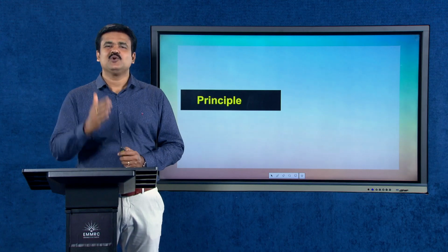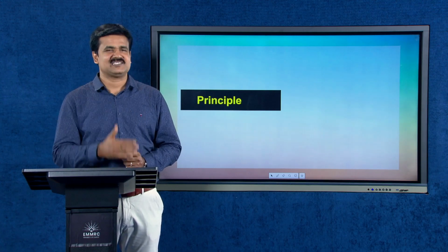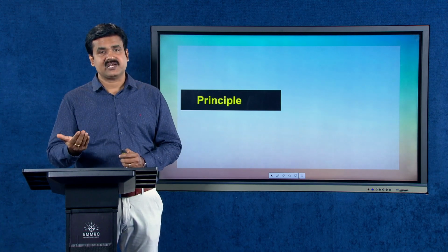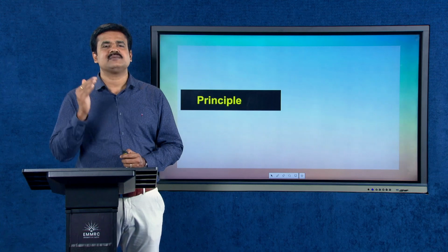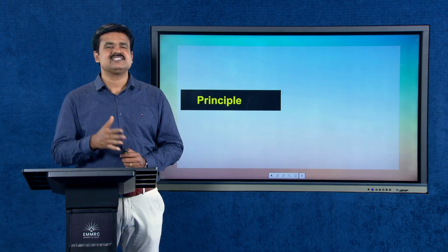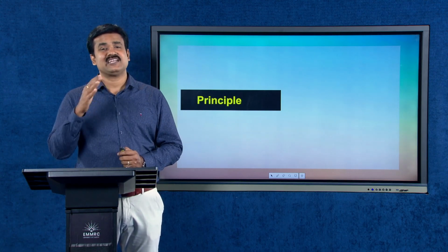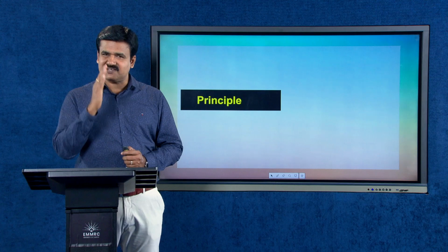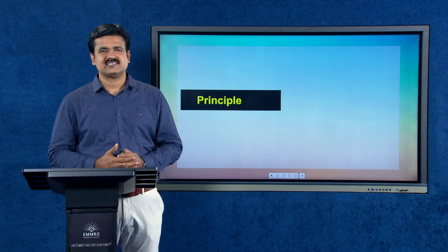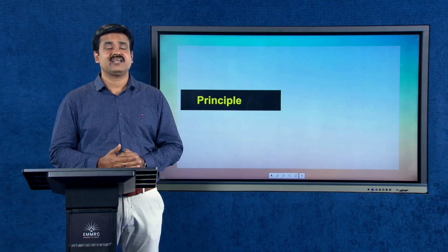For which you have to first reduce the given ferric ion solution to ferrous ion. Then again that ferrous ion is oxidized to ferric ion by utilizing potassium dichromate. So, this is very interesting principle and procedure behind this experiment. There is no direct reaction between potassium dichromate and ferric ion. So, you have to first reduce the ferric ion to ferrous ion and then oxidize that ferrous ion to ferric ion quantitatively, which makes the estimation of ferric ion possible.